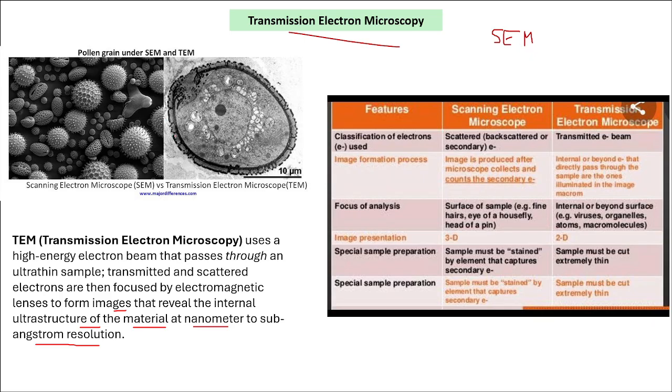Okay, now see the difference. This image is of a pollen grain that has been visualized under scanning electron microscopy and by transmission electron microscopy. At this point, you can see the 3D kind of image and the surface topography, but not the internal structure. But in this one, the transmission electron microscopy of a pollen grain, you can see the surface topography as well as somewhat the internal structure, and there is no 3D image that you can see in this. So this is the main difference.